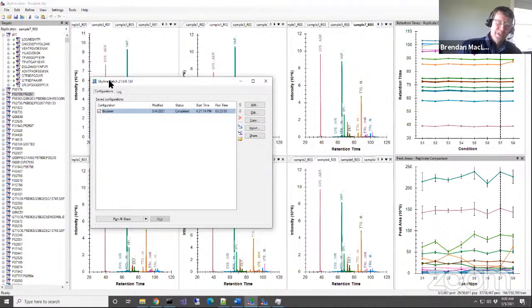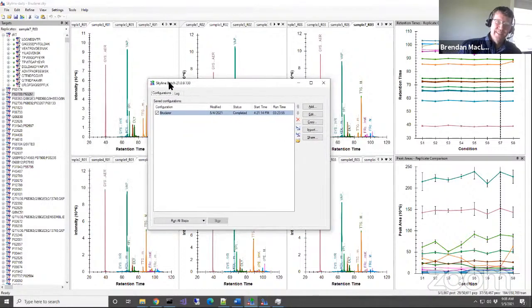Hopefully everybody has access to some computer with a pretty fast network. That's the only way you're going to get these files. I'm happy that I was able to condense what you absolutely need down to less than a gigabyte, but quite a number of gigabytes worth of data get downloaded.